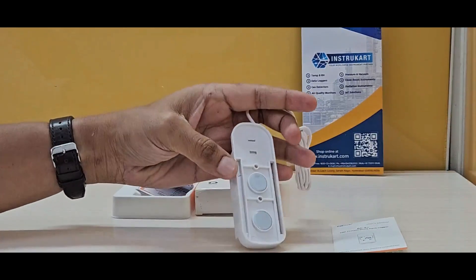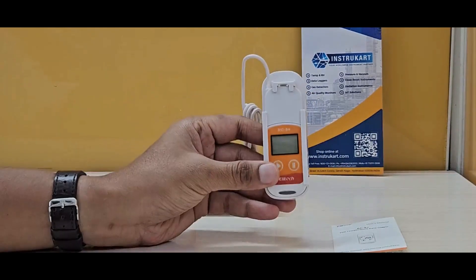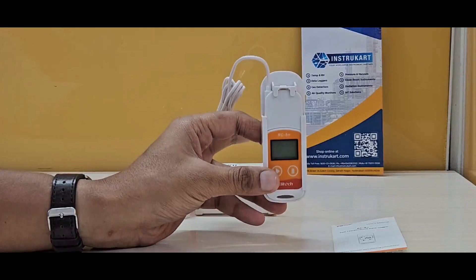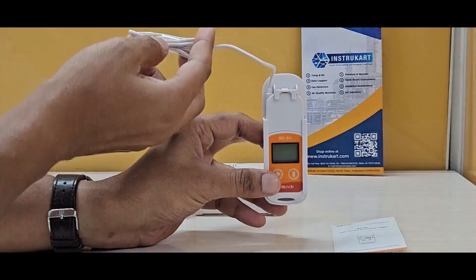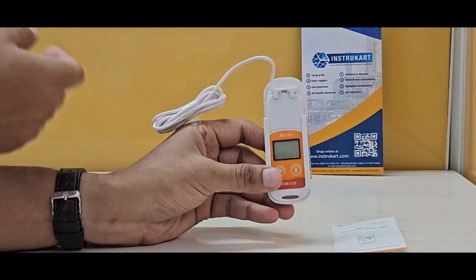You can place this device at the back, as you can see, with the magnet. You can place this device outside while the external sensor can be placed inside the chamber, freezer, or wherever you want to take the temperature reading.